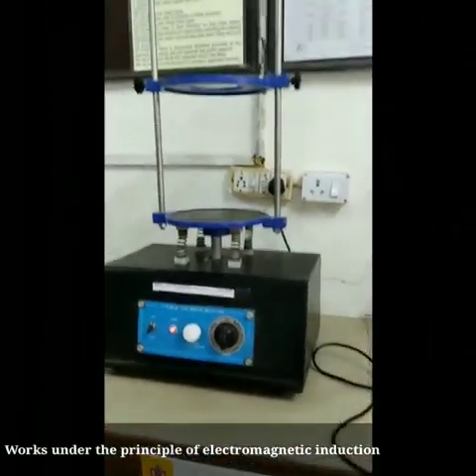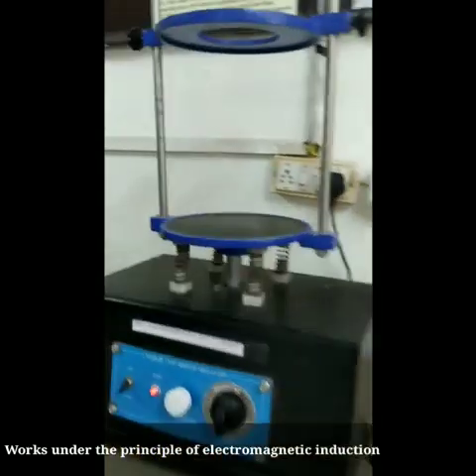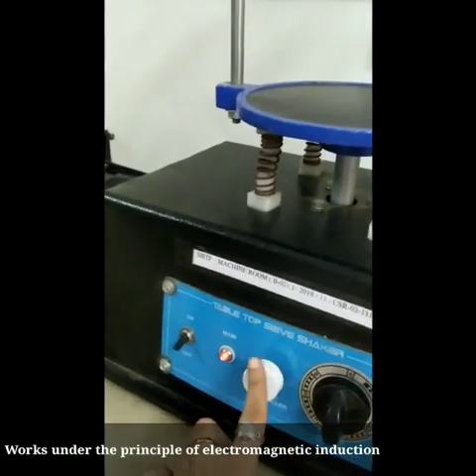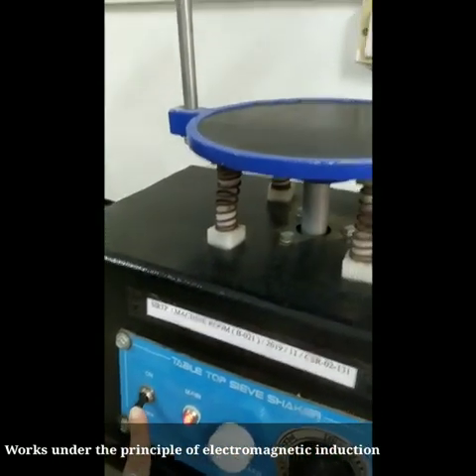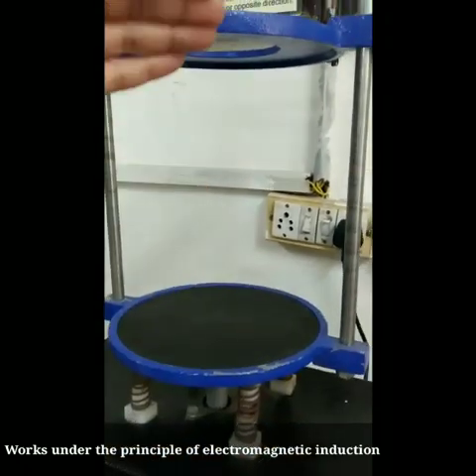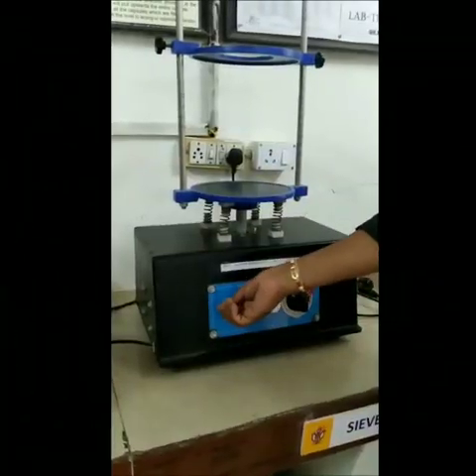This is an automatic sieve shaker. Initially we had seen the mechanical sieve shaker which is used manually, but this sieve shaker works automatically. Here we can see the speed controller and the timer — we can set how much time to operate — and this is the speed on/off button. We arrange our sieves here: at the bottom we keep the collector, and above that we keep our sieves. From these bolts or nuts we tighten our sieves.